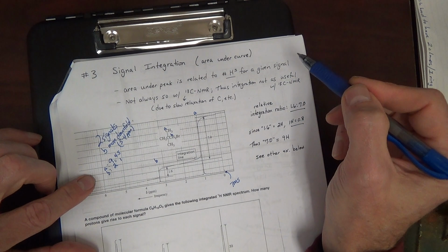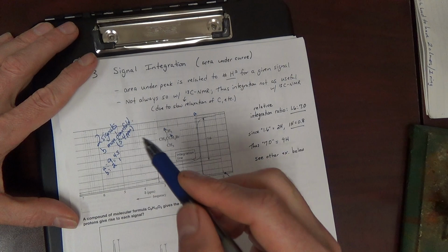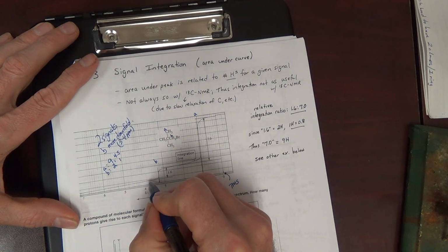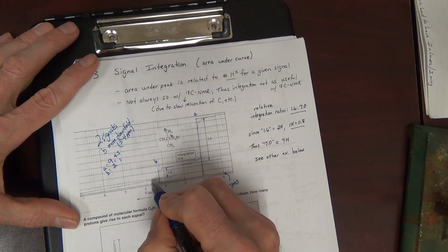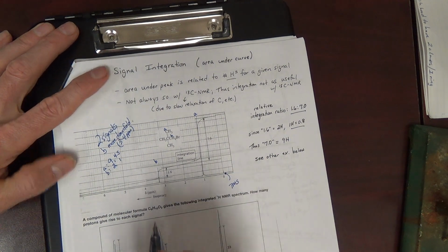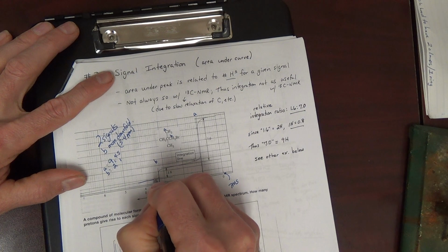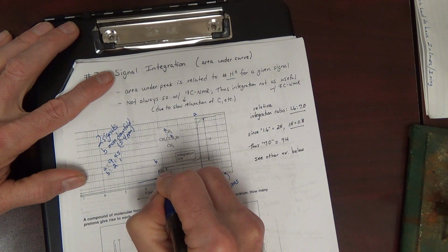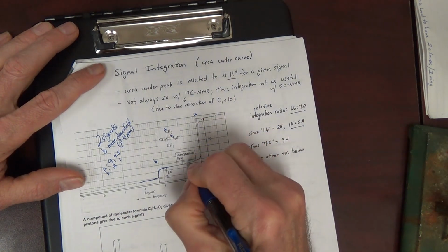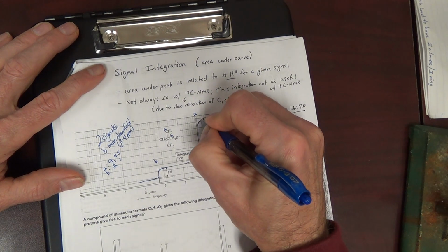Now, how will integration be given to you? The older and standard instruments used an integral line, which sort of scopes over the signal. It comes along here, and when it gets to the signal it rises and then flattens back out. Here it rises, and then flattens back out.